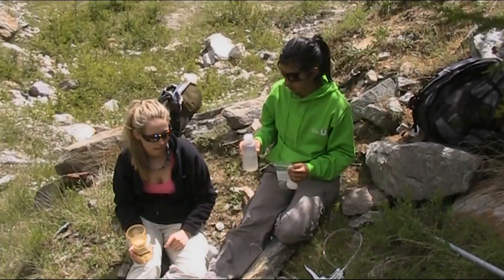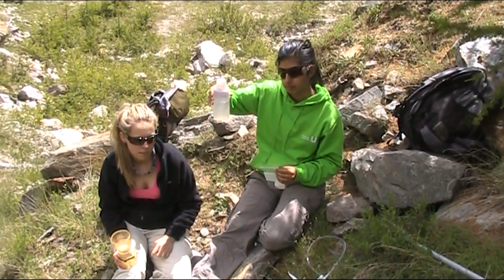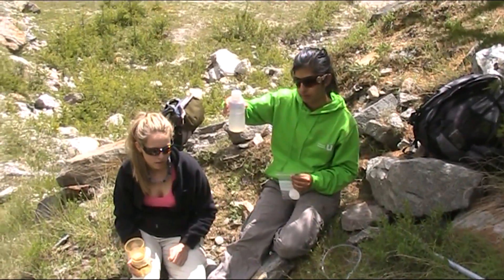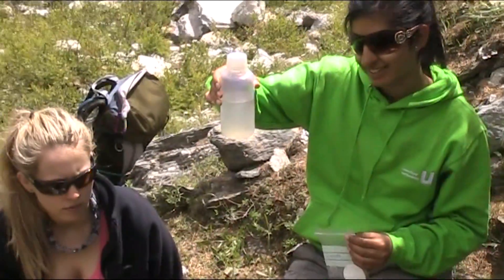We have collected our suspended sediment sample from the river. We have moved away from the river to make this section of the video because it is too noisy and you won't be able to hear us talking. So there is our sample that someone is holding up. We have taken quite a bit for reasons that we will explain in a few moments.